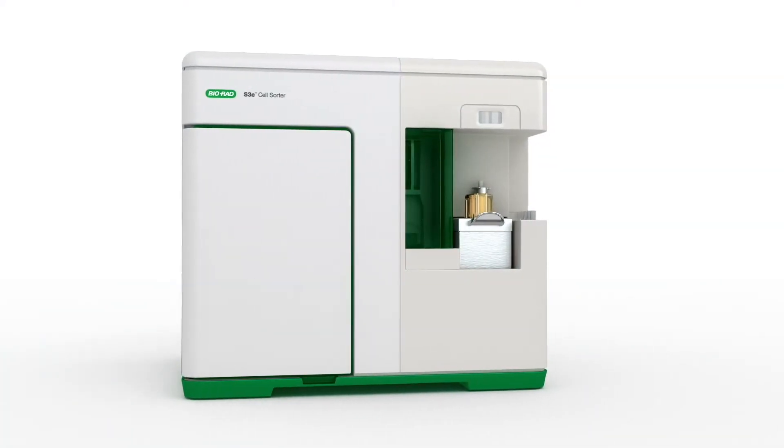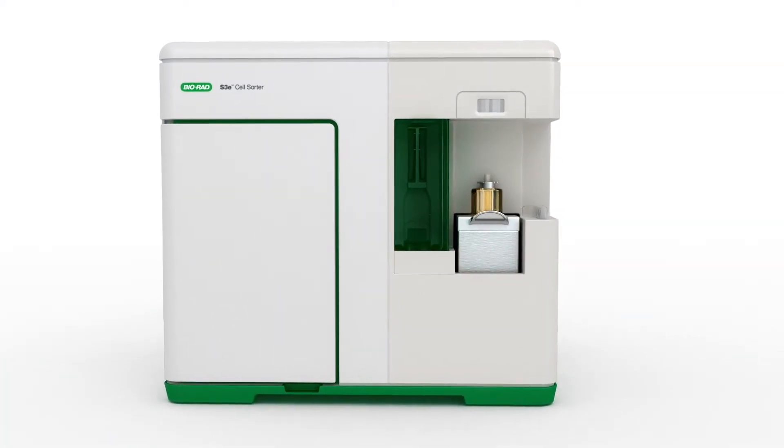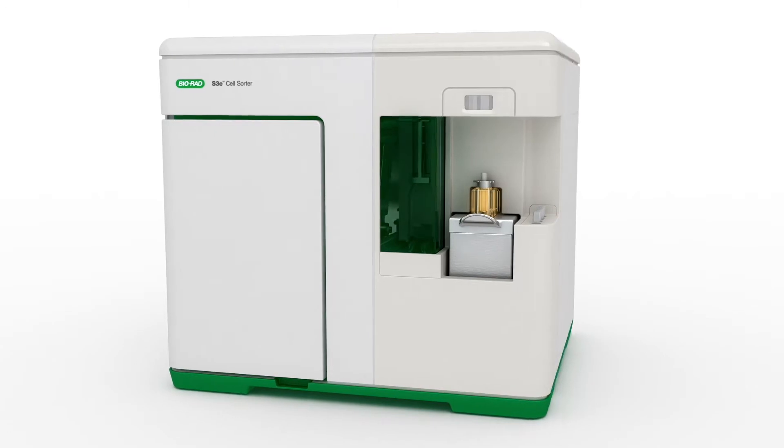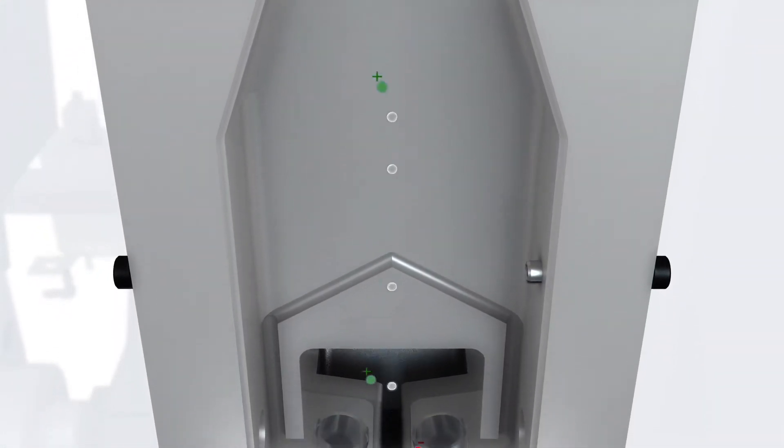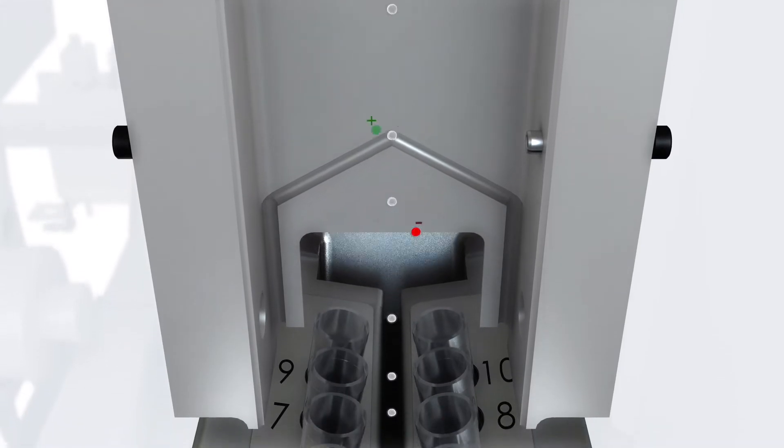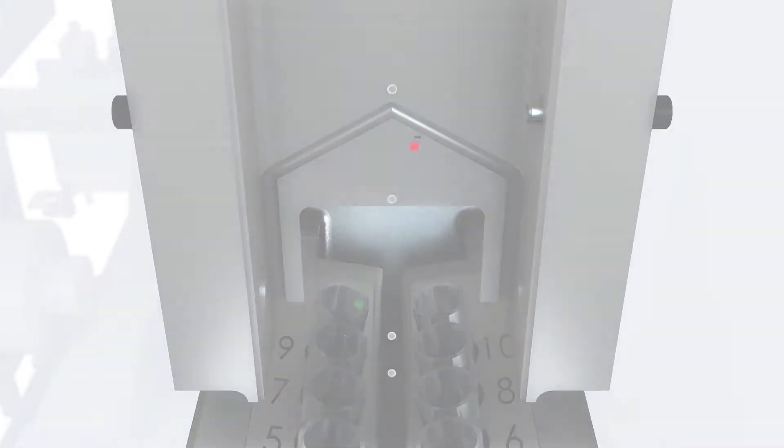Enter the S3E Cell Sorter from Bio-Rad, an easy-to-use, high-speed cell sorter that fits right on your bench. It lets you sort for intracellular and extracellular markers to give you the pure, viable cell populations needed for your research.